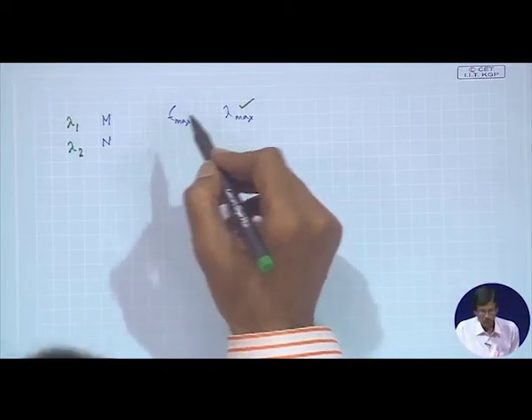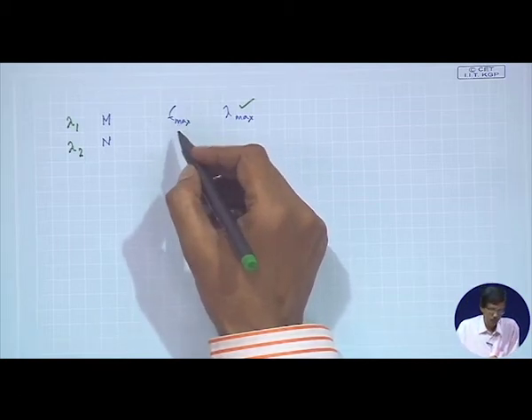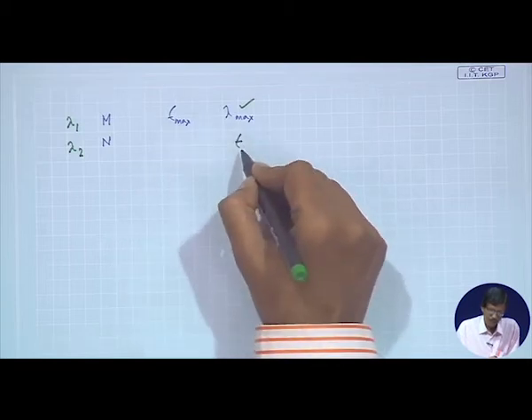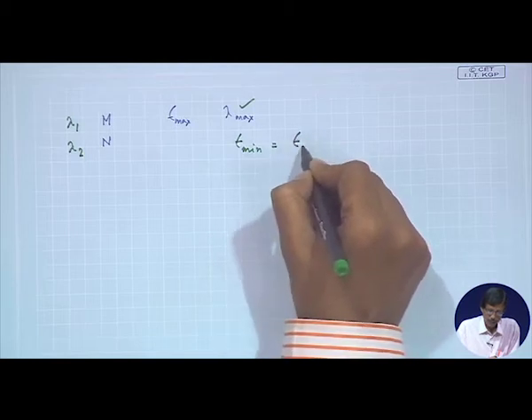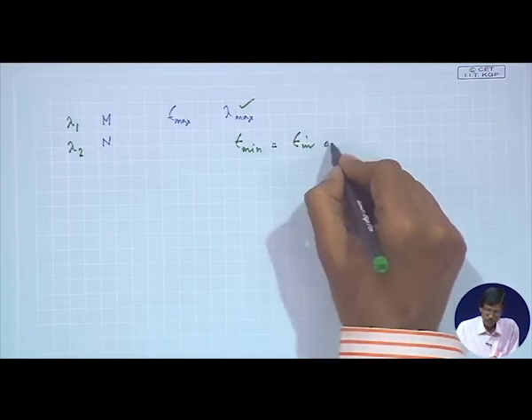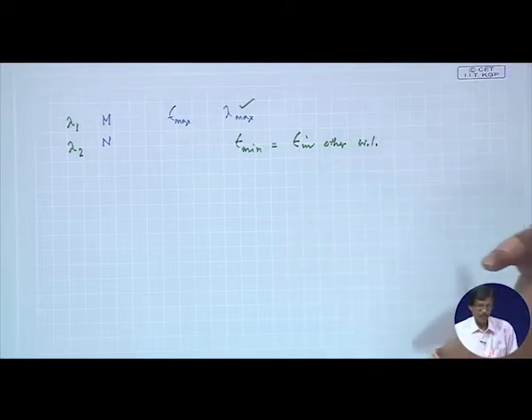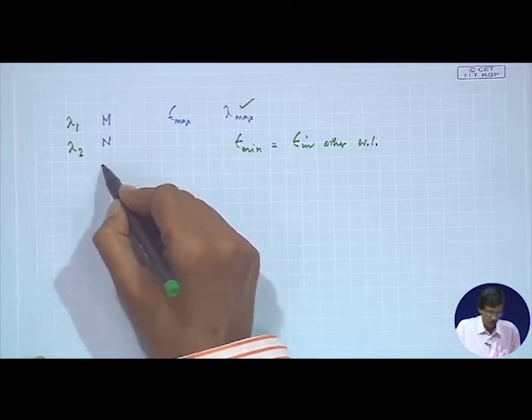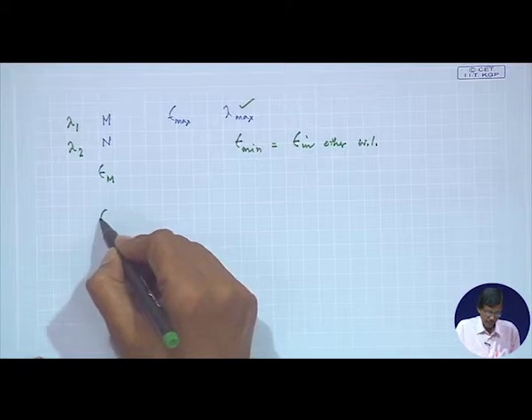Now, we should know the other absorbances also, which we can consider as the corresponding epsilon, not as maximum, but as epsilon in other wavelength. Okay.